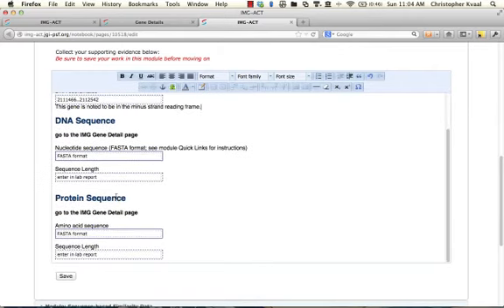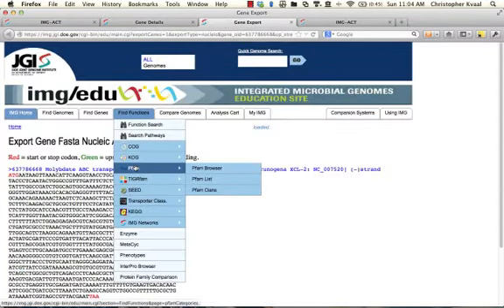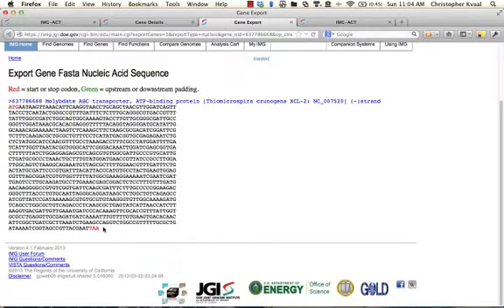Now, to go on and further analyze whether or not this is a gene and how it works, we're going to need to gather some information. One thing I can see right here is a hyperlink that says 1077 base pairs. I'm going to click on that hyperlink and open it in a new tab where it says gene export. Here we're going to see some really cool features. I'm going to highlight it all, noting that I've taken all of the letters, the nucleic acids, as well as this caret, or greater than symbol, and this information up above, and I've copied that.